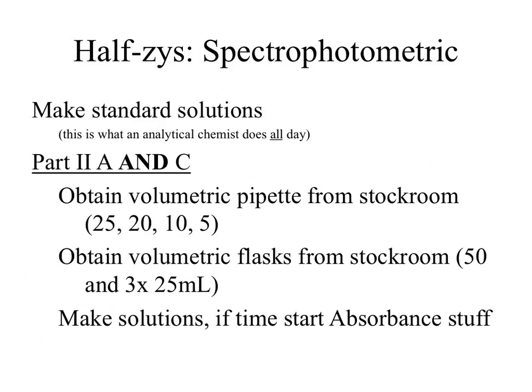When you start to do that process in the room, I'll help make sure you get set up with that. It's going to be put sample in, record. Take sample out, put blank in, 0. Take blank out, put sample in, record. Take sample out, put blank in, 0. Take blank out, put sample in, record. Take sample out, put blank in. Very, very tedious. You're looking at 50 measurements of that.